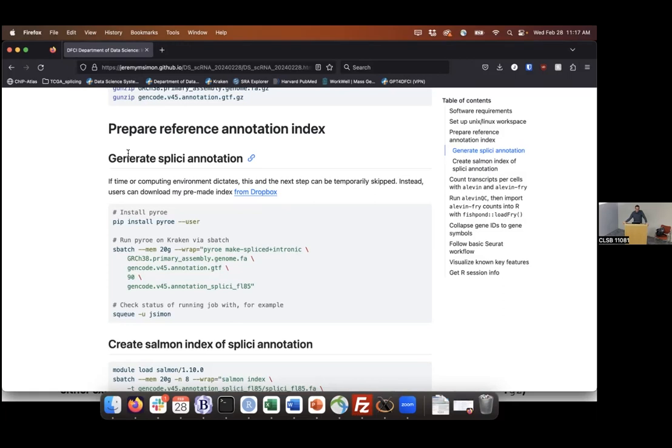There is some description of that, and it can get kind of scary, especially when you factor in allowing for mismatches, which we often do. There has been some discussion on Twitter and maybe in some papers about the frequency of barcode collisions and how we should be more careful. I think it was a bigger problem in the old days when we had hexamers. Sure, if you have a shorter barcode sequence, then your rate of collision is going to be way, way higher.